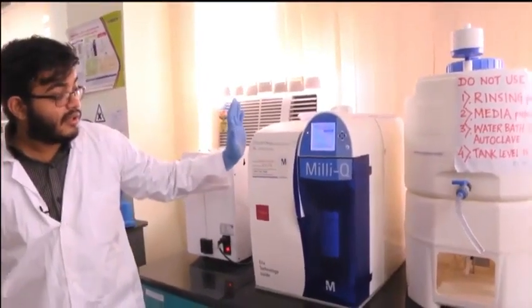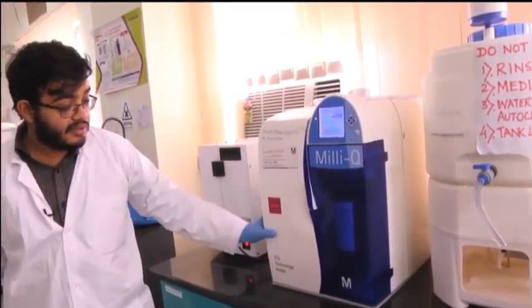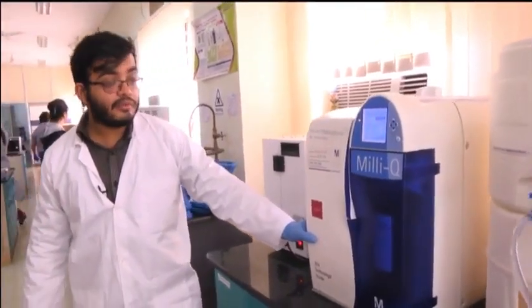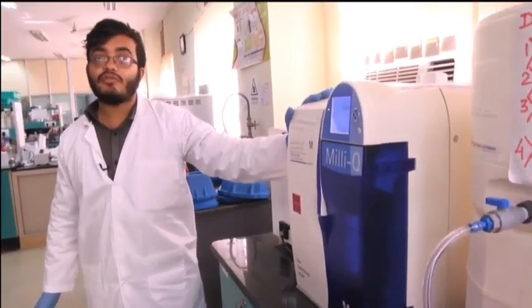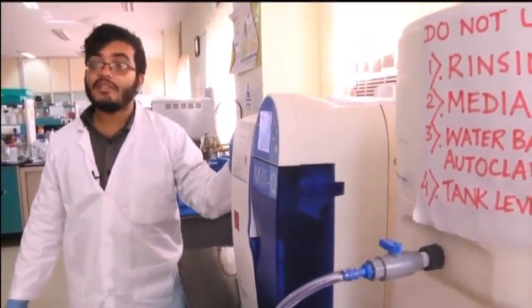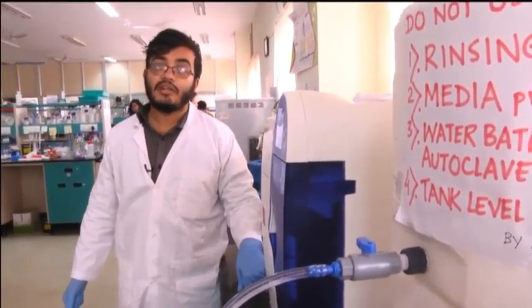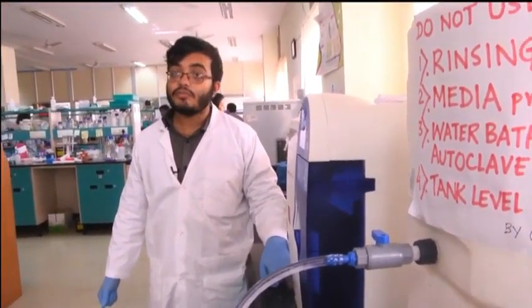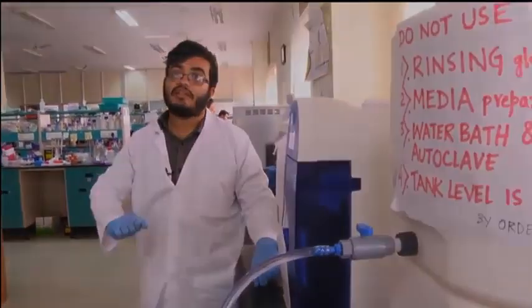So this is the general principle. We have a particular company's water purification unit, but there are different companies which build similar instruments and they all work on the same basic principle. And always keep in mind that the water which you are using for setting up your experimental reactions needs to be deionized. It should not just be taken from the tap and used directly.